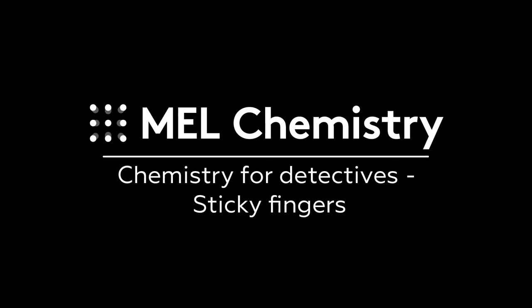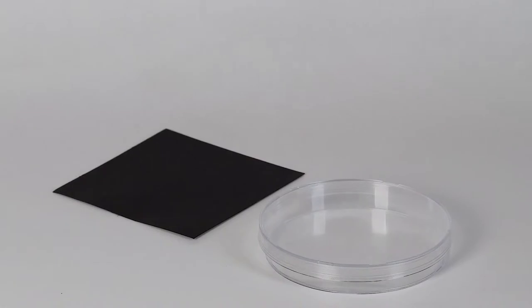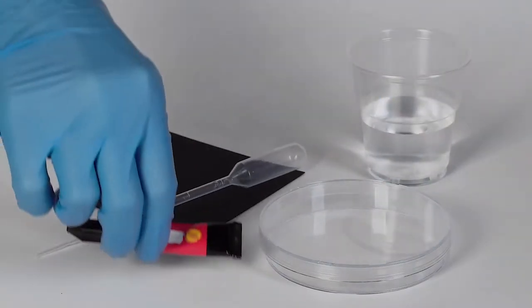For the sticky fingers experiment, you will need the Petri dish, a sheet of black paper, the Pasteur pipette, some water, and some superglue.